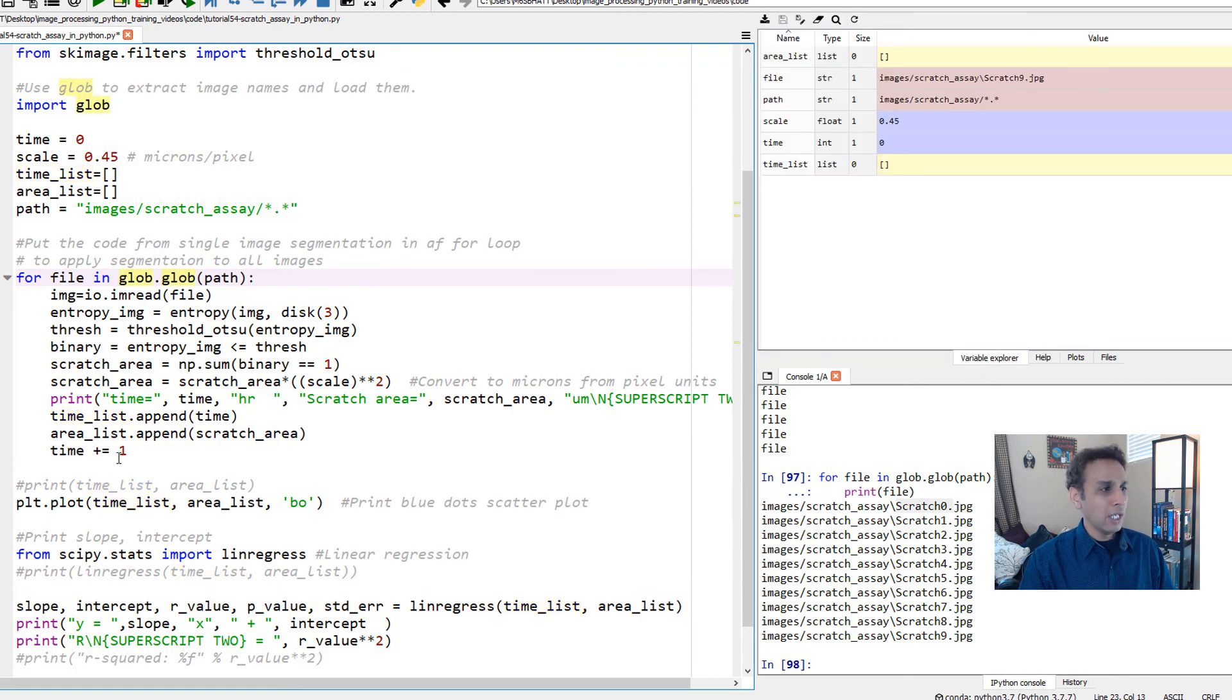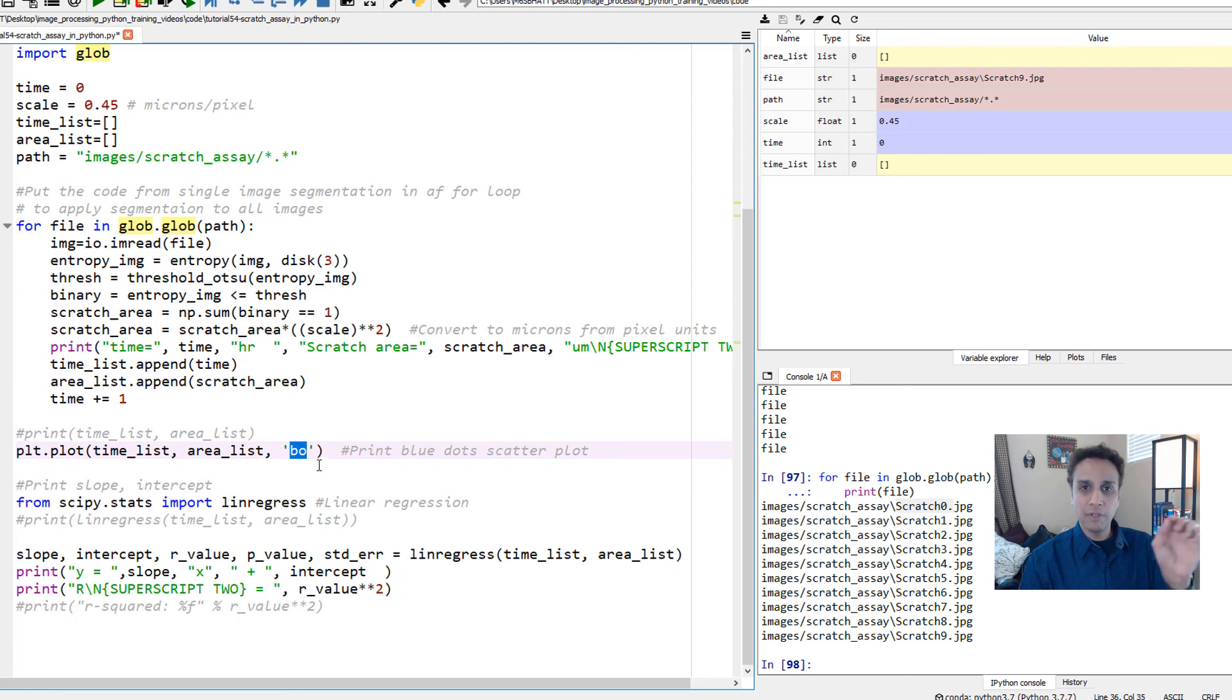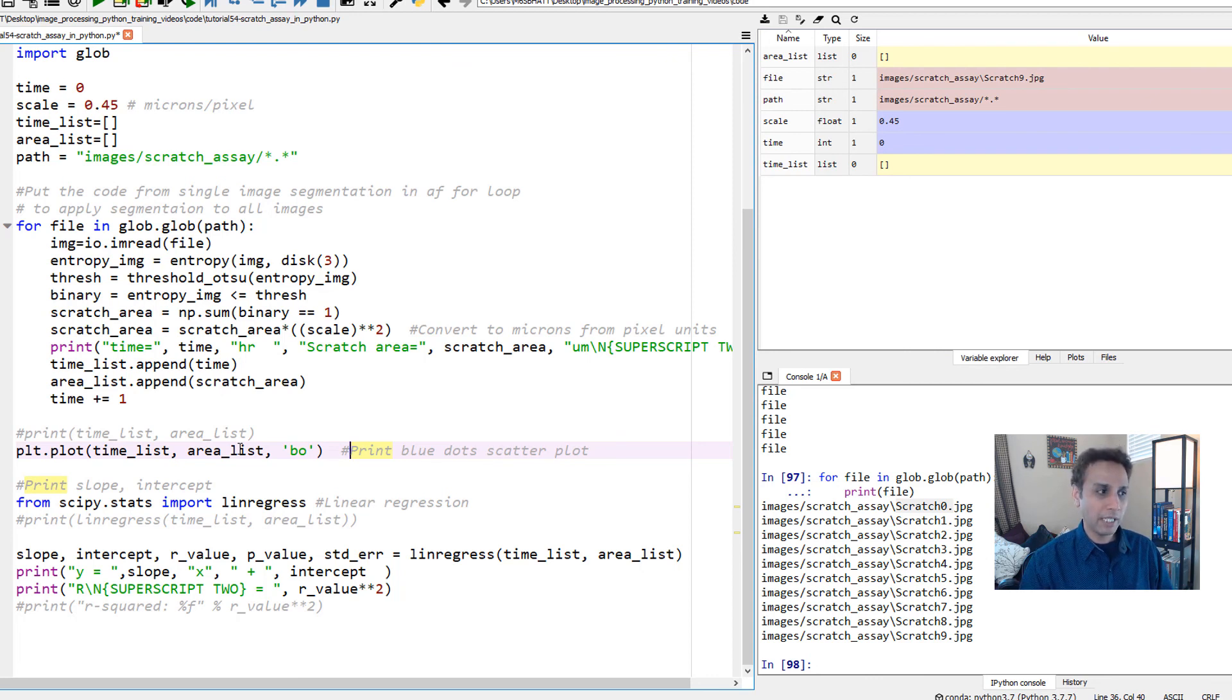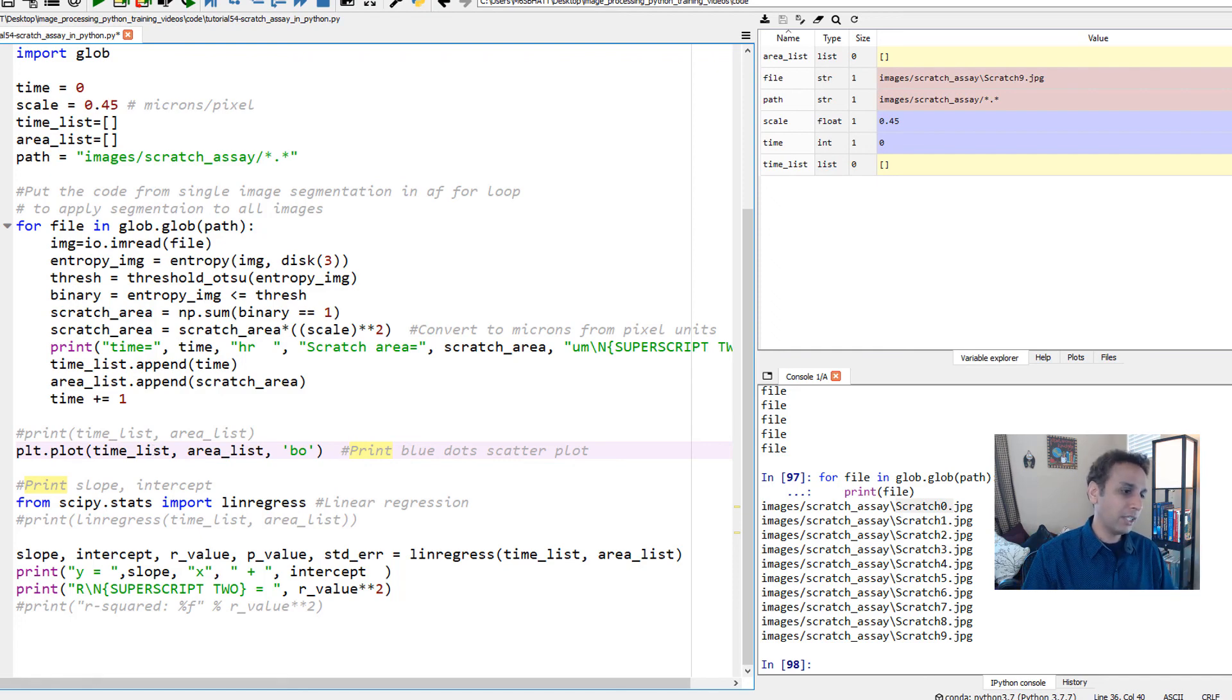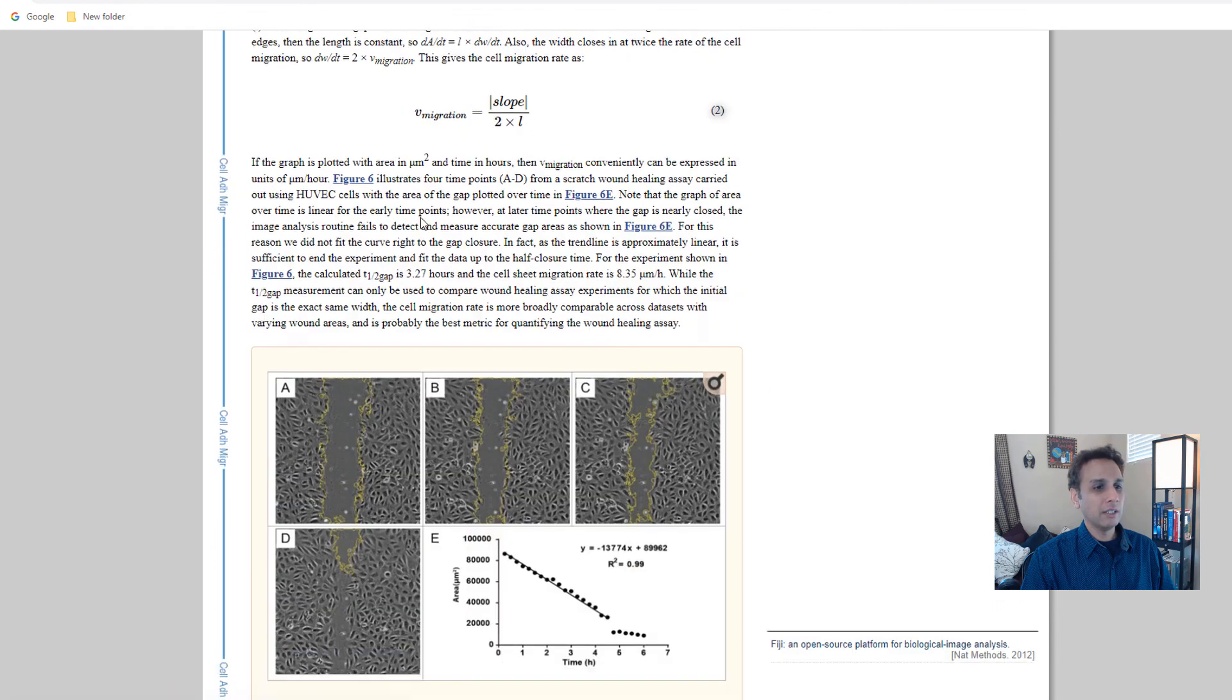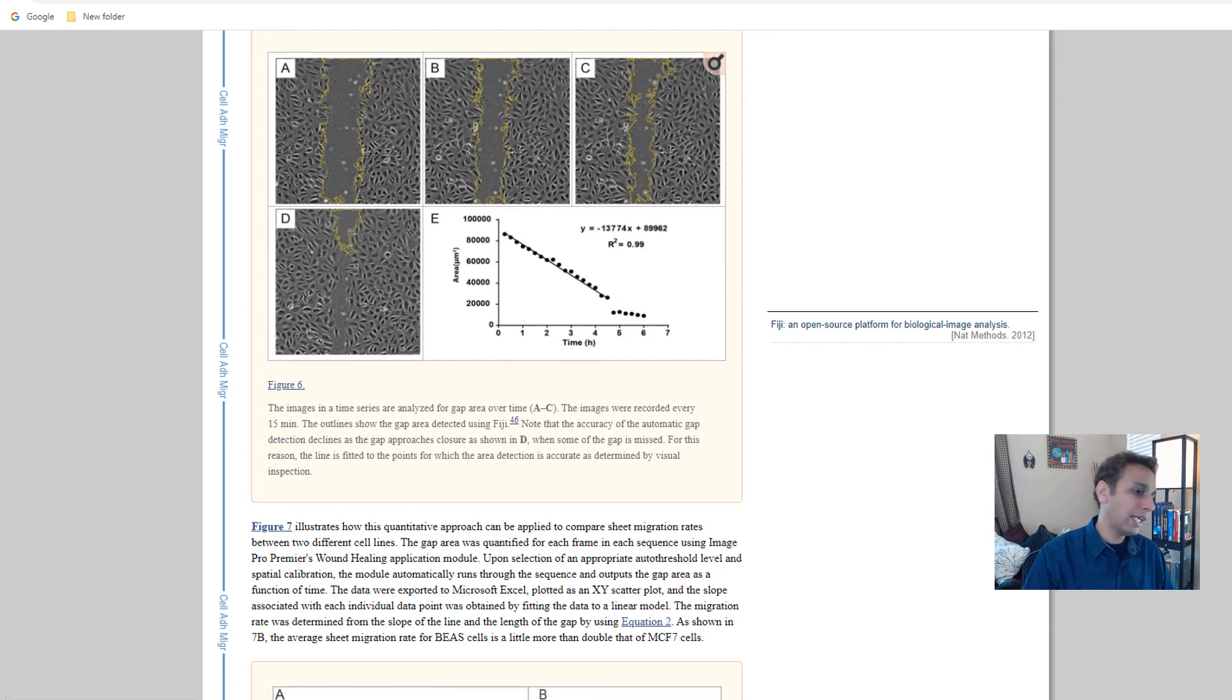How do you plot it? Very simple. In pyplot use plt.plot, time_list, area_list and blue circles for data points. Plotting unfortunately doesn't give you linear regression tools, so let's fit a linear line just like these guys have done, fit a linear line to these data points and get our equation and print out the R squared value.